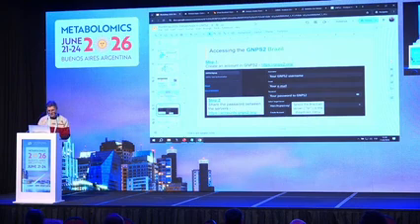Sure, yeah. I was wondering whether you had a chance to compare it to some other in silico tools, like Sirius, for instance. We did not directly compare with other tools. Both for NAP and for ChemWalker, we are not doing the in silico fragmentation from scratch.